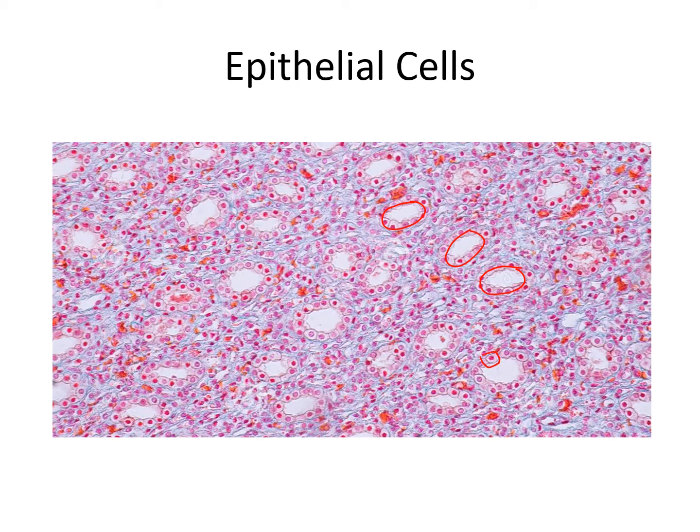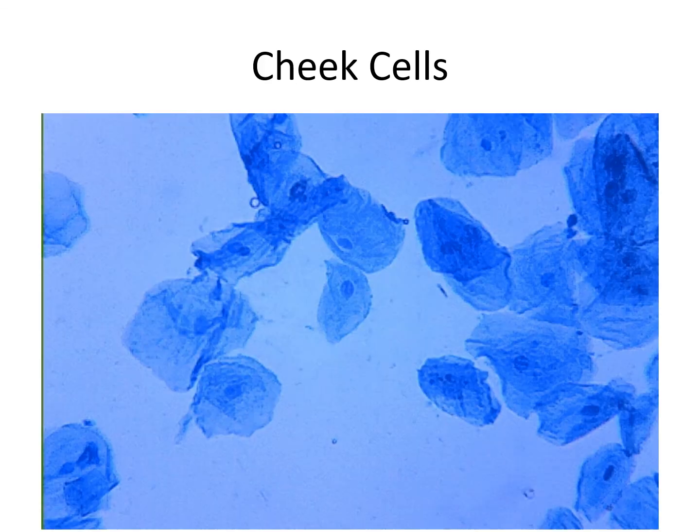So you want to get used to identifying the cells. You should be able to see the cell membrane, and then the nucleus is that brighter pink round structure inside the cell. You will also look at some cheek cells, and cheek cells can be a lot easier to see. For the cheek cell, this would be one individual cheek cell here, and that is the outside of the cell membrane, and of course the organelle that is easiest to identify is the nucleus.